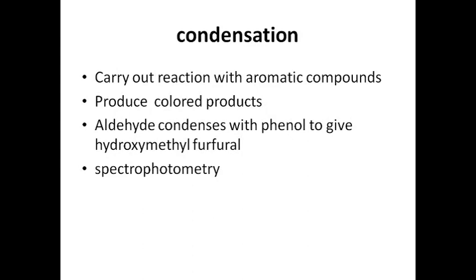Now about condensation methods. Sugars can react with aromatic compounds and produce colored complexes. These colored complexes can be estimated spectrophotometrically.